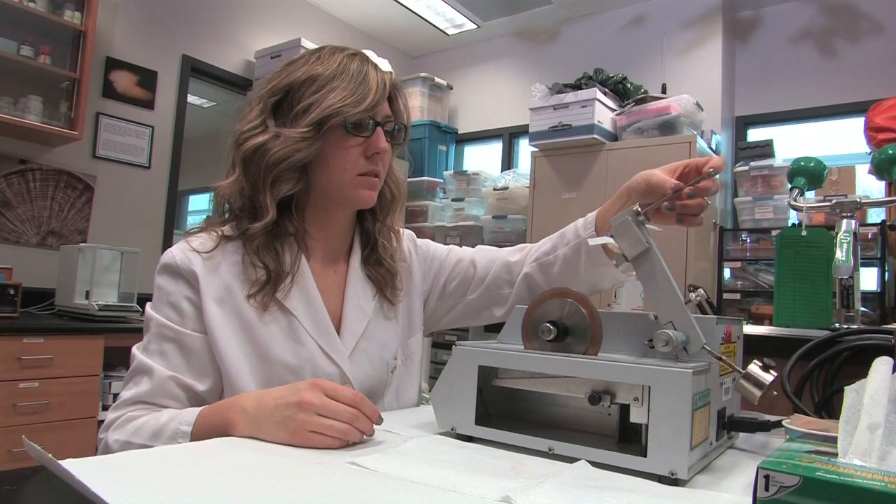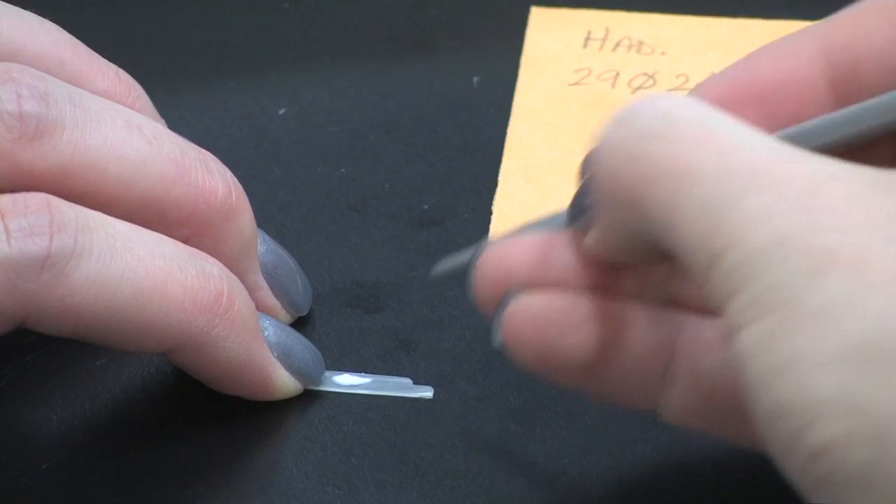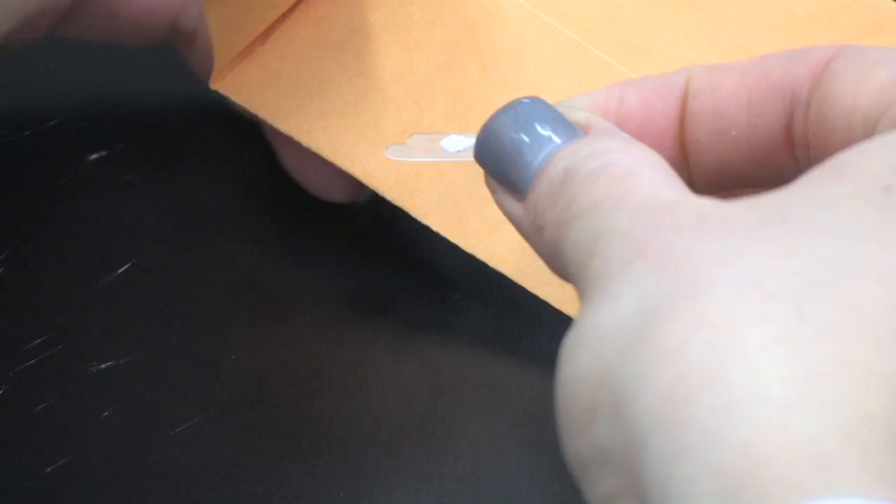Sections can be stored dry and don't need to be mounted on a slide. If desired, they can be glued to the slide with a little epoxy or crazy glue. Label the section using the diamond tip pen and keep all pieces stored in a suitable labeled envelope or container.